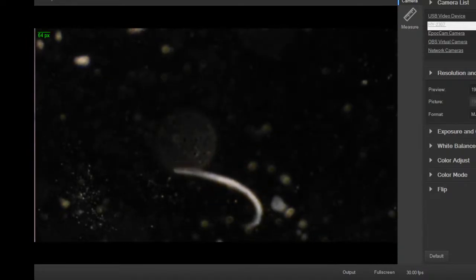Positive he was not on that other slide with the... I only sucked up the one guy with the... Yep, there was a nematode on that slide too. Eh, I haven't had a nematode for a while. Let's do that. Look at the nematode while I look for the tardigrade elsewhere.